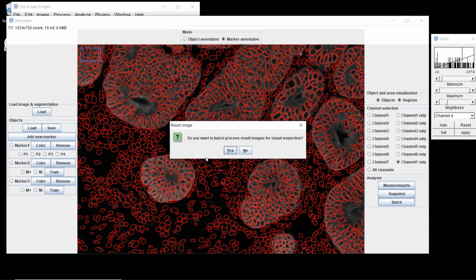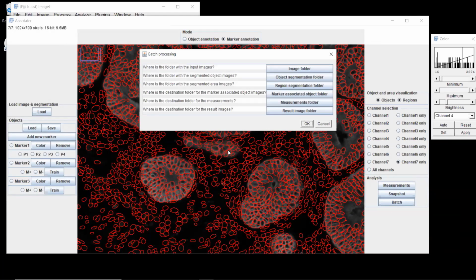And it's always better to make sure that you don't have outliers in your input images. And if you don't check them, you won't know. Because here you see we have lots of features. We have measurements, so we have lots and lots of features. And you will always have numbers to process, to analyze. But if these numbers don't really correspond to something that's happening in your images, that's not good. So I would also very much suggest to hit yes.